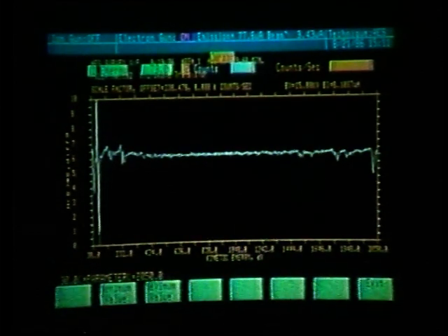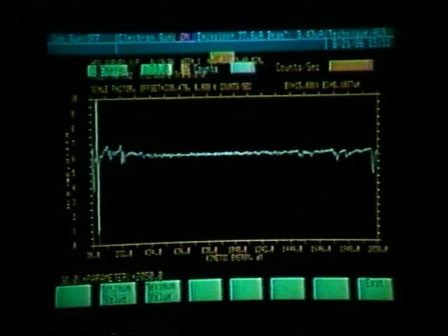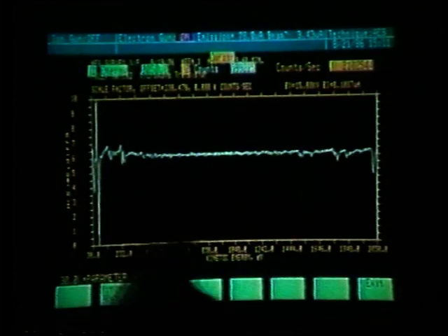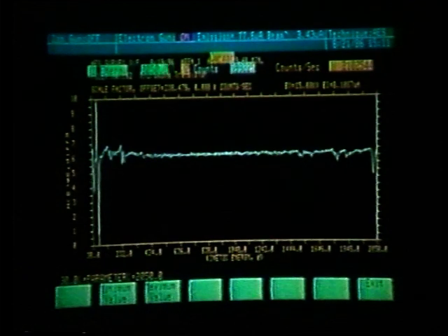I would then like to identify the peak at the high energy. What I can do to quickly go out to that energy or near that energy is type in an energy value of 2050, and enter. That has quickly moved the cursor out to 2050, and I can now slew the cursor to the negative most excursion.